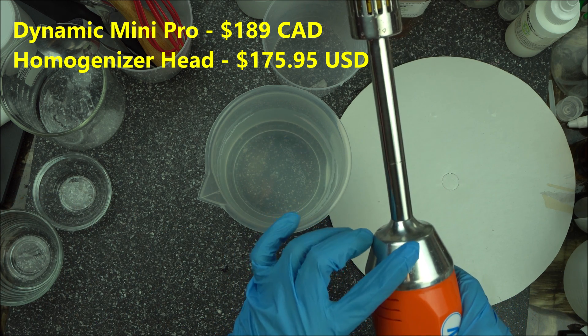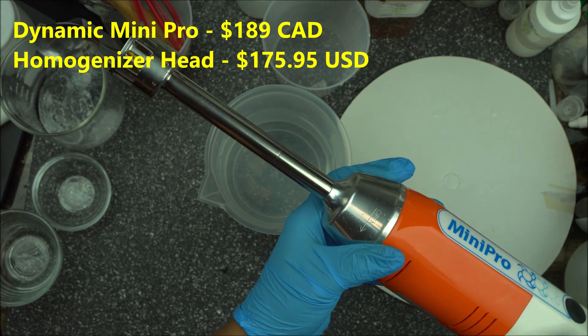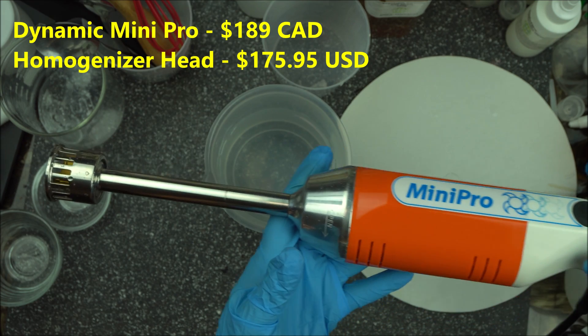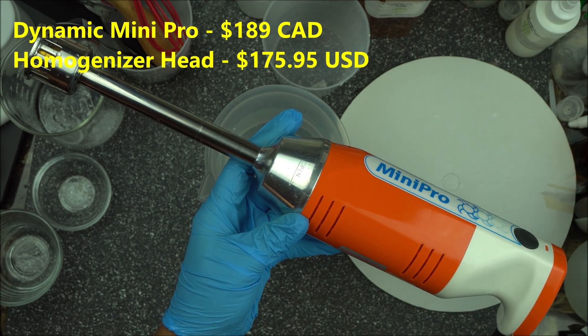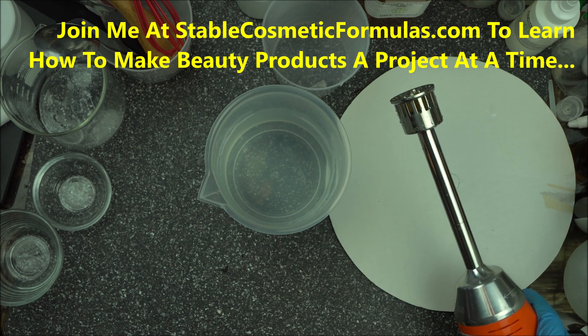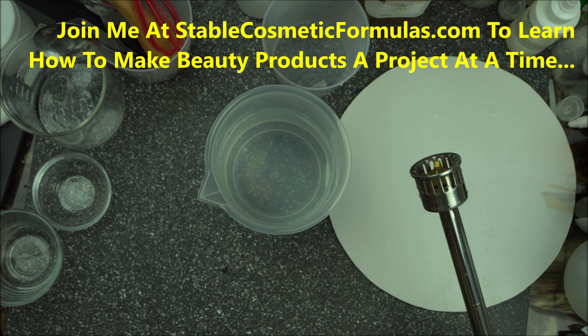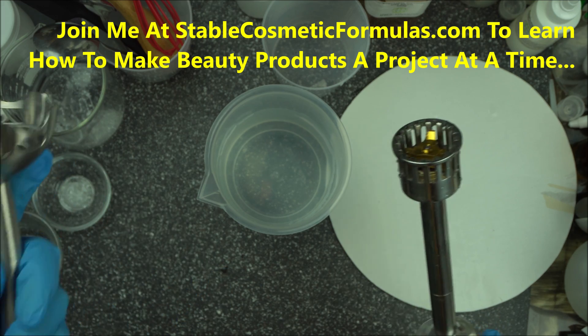I bought just the homogenizer head in Canada for about $200. As a cosmetic formulator, the best you can do is invest in what will make your job easier. As you continue growing your formulation journey, this is something you might want to consider.